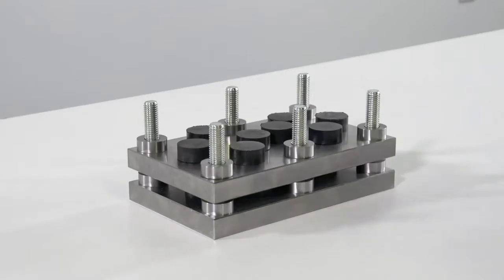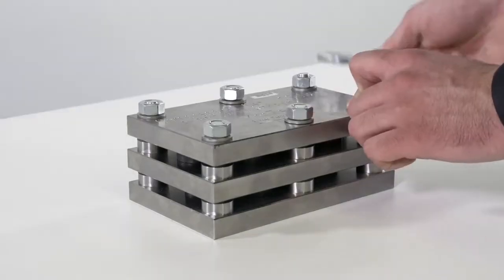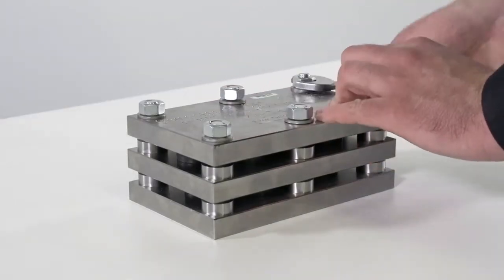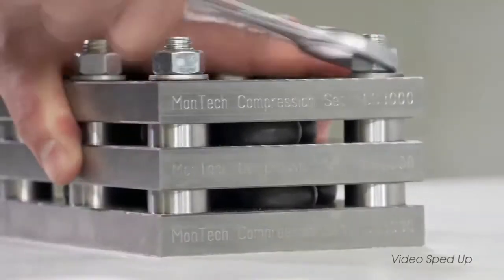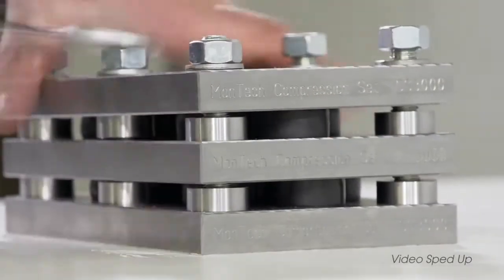The CS3000 works by compressing samples between two flat parallel plates for a specified duration of time and with a specified temperature to show a material's ability to return to its original thickness.